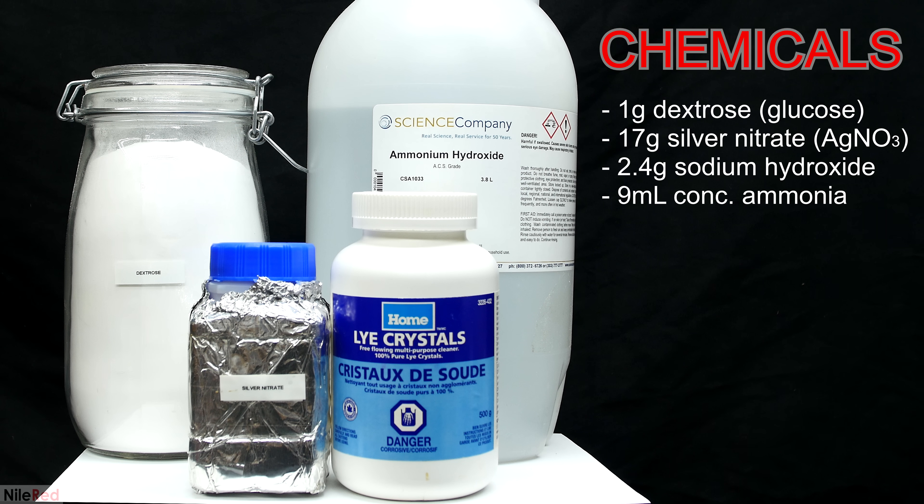To make the Tollens reagent, I need silver nitrate, sodium hydroxide, and ammonium hydroxide, which is also known as aqueous ammonia. The sugar on the left is dextrose, and it's used in the silver mirror demonstration, but it's not used for the actual Tollens reagent.